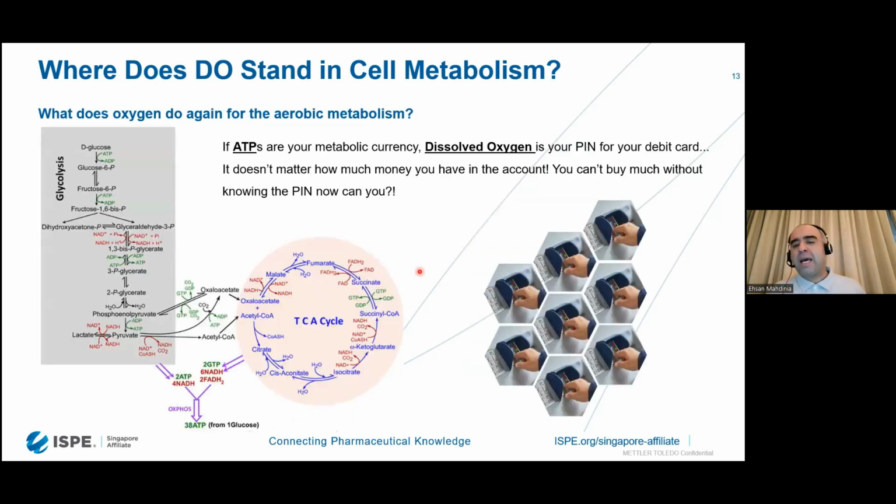When you look at the catabolic pathway for energy production in the cytoplasm and in the mitochondria of the cells, right? If glucose goes without oxygen all the way through glycolysis, it ends up as pyruvate, and then the loop is complete, coming out as lactate, in anaerobic respiration. But by doing that, the cell only gains 2 ATPs for energy. If oxygen comes in, the pyruvate can now enter the TCA cycle, and it can only do that with abundant oxygen present. Then the oxidation process is complete. Pyruvates go through to CO2, and each glucose can give up to an extra 36 ATPs.